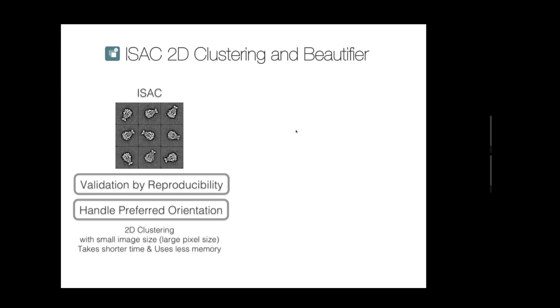ISAC is also capable of handling datasets with strong preferred orientation. As an example, this demonstrates the algorithm can handle a protein with a long shape instead of a globular shape, separating particles into many classes and centering them well. Because of the recent optimization, ISAC now finishes within hours instead of days, and can handle larger datasets than the previous version.